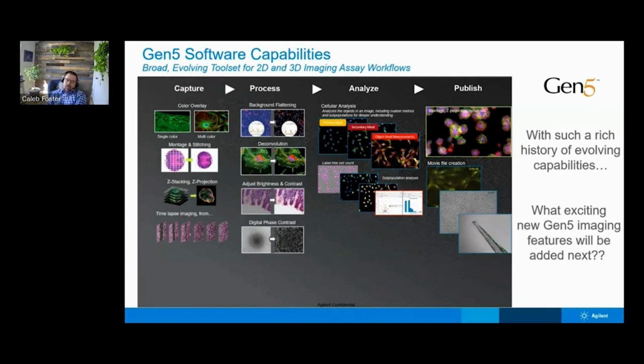I do not. I think there's always going to be a need for simple, quick answer tools. I think we are seeing a huge growth in more complex cell models, more complex 3D models, things like stem cells that are a much longer workflow. But we have a pretty strong finger on the pulse of what our customers are doing and using in applications.